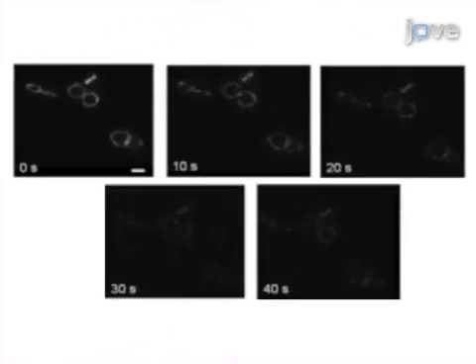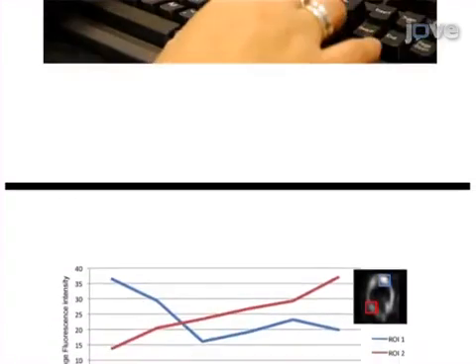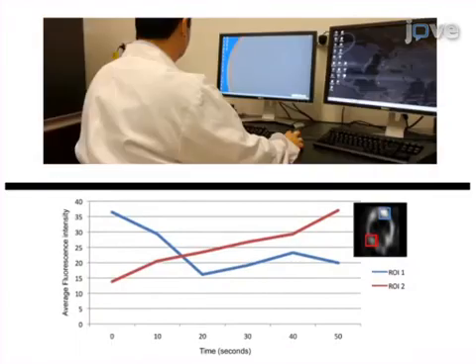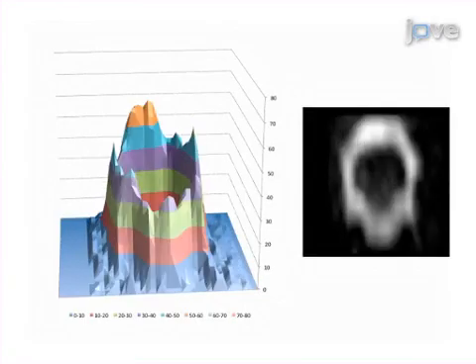Next, the quality of the raw data is assessed, and images with greater than 30% decrease in intensity due to photobleaching are discarded. The final step is to quantitatively analyze the changes in the protein localization during cell division by measuring the fluorescence intensity distribution of the FtsZ GFP protein over time. Ultimately, fast 3D SIM is used to show how dynamic the divisome proteins are during cell division in bacteria.